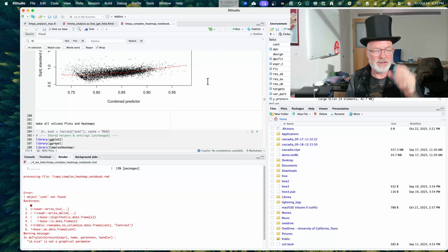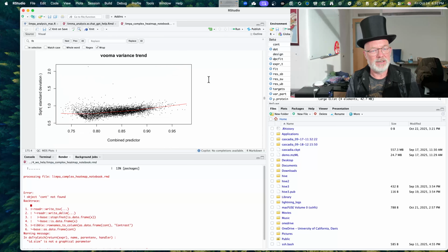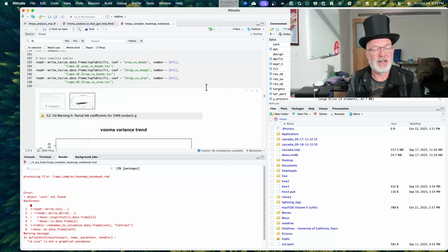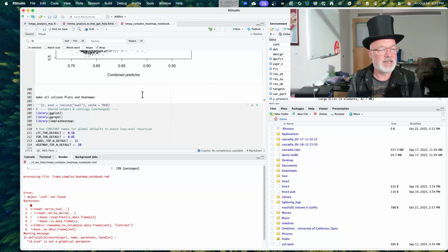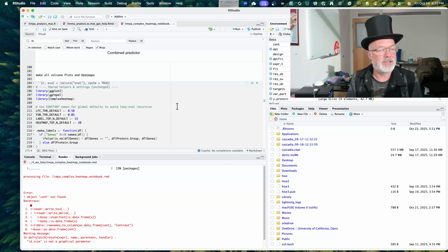All right, now that we have all this data, and we have all our protein data without any missing values, we don't have to worry about missing values. We have all the probabilities of how often we should see everything, and we start making some plots. And I used ComplexHeatmap and ChatGPT to help me make some volcano plots, and they turned out really pretty.